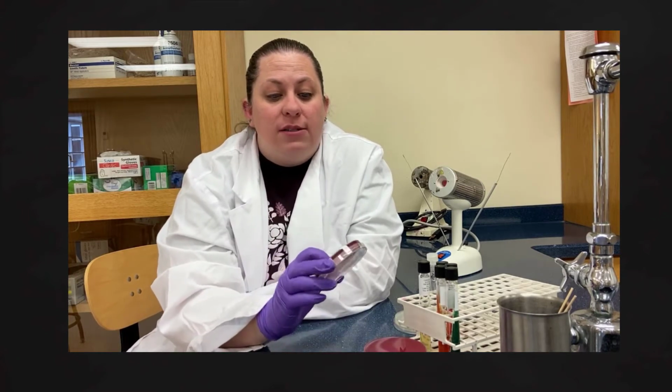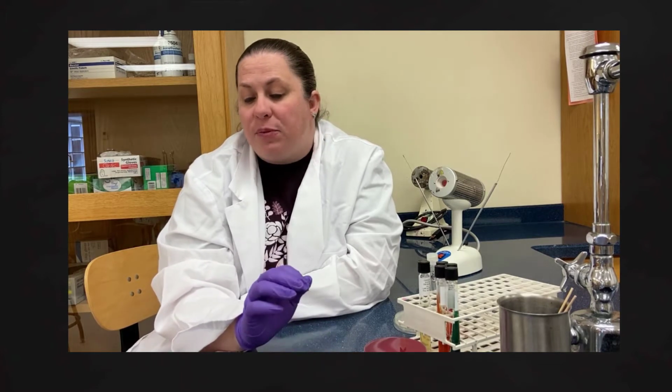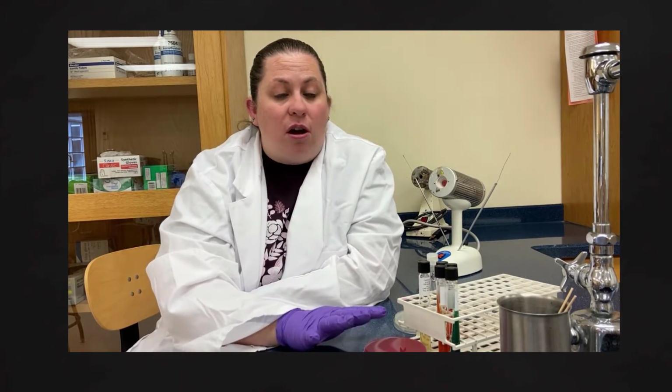Sometimes these media are what we consider selective. These selective media will sometimes be used in order to select against one type of bacteria, but allow another to grow. When we look at McConkey's agar, this type of agar is going to allow for gram-negative bacteria to grow on it, but not gram-positive. And so because of that, it's going to pick what gets to grow on it. All right, sometimes we might add antibiotics to the plate, and that would also hinder some bacteria from growing.